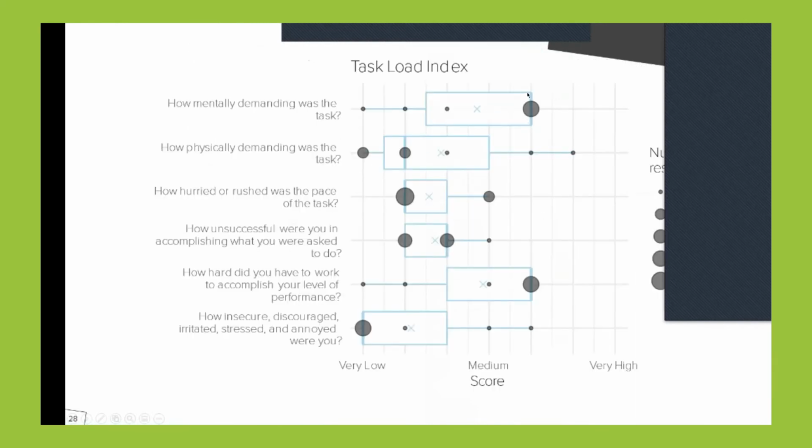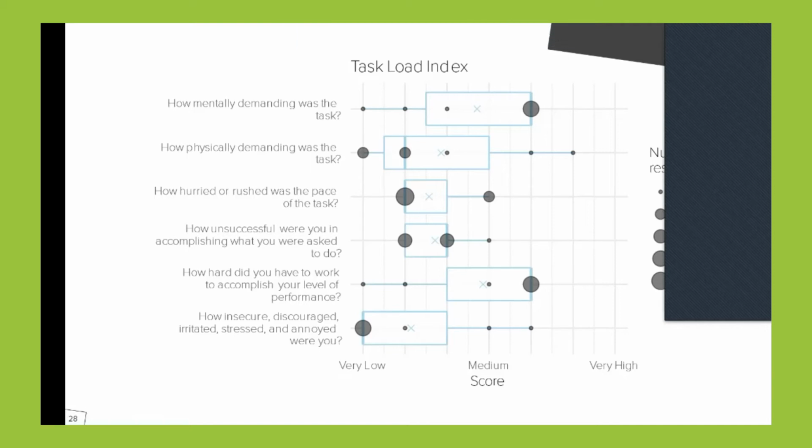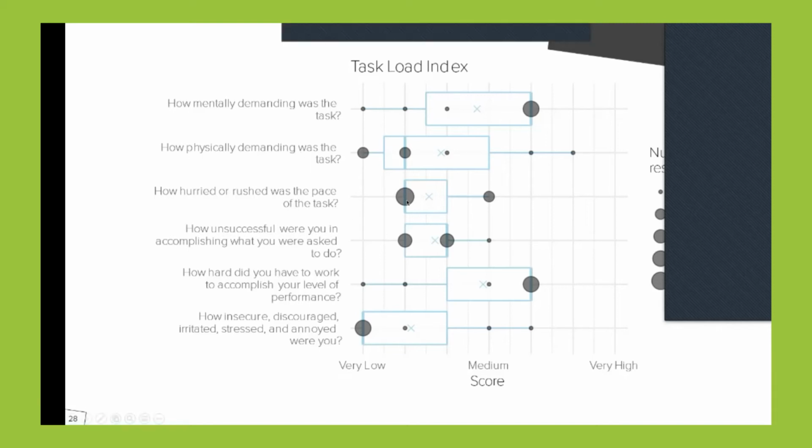And as I mentioned before, we also did the evaluation in terms of this task load index. So people were asked, for example, how mentally demanding was the task, where we achieved kind of a medium score. Physically demanding, it was scored rather low. And this is actually interesting, because what people are used to in cell tracking is moving around the mouse, being stationary at your desk, not actually moving in any way. Now here you suddenly use your entire body to follow cells around, and people nevertheless did not find this strenuous. They also were happy with the pace this was executed with.